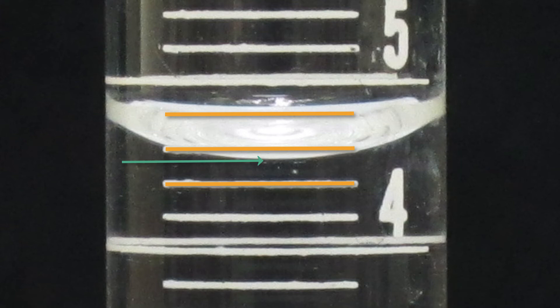There's the marking. I've put that mustard-colored line for the marks on the graduated cylinder, and the green arrow is pointing to the bottom of the meniscus.